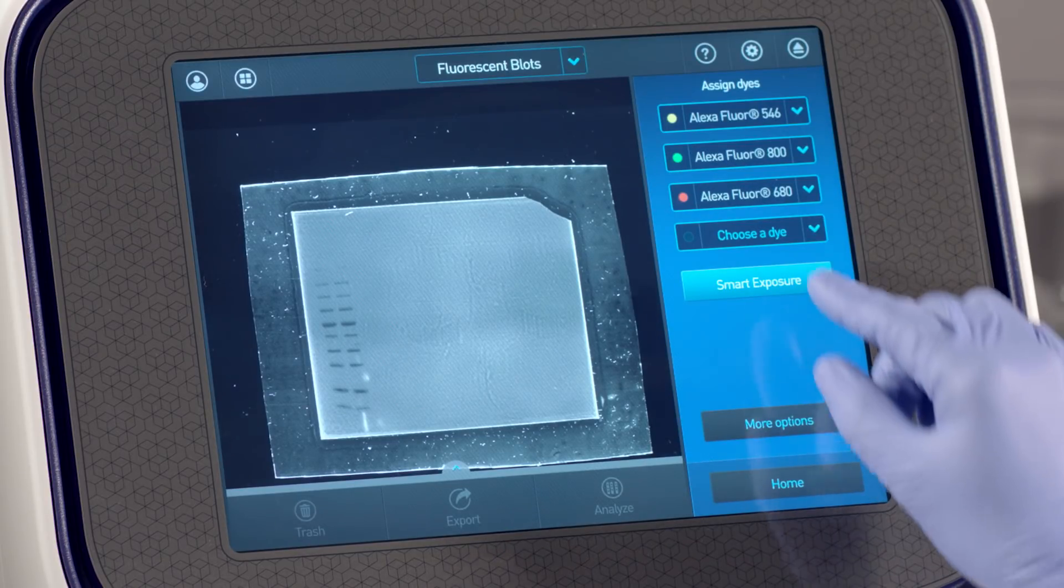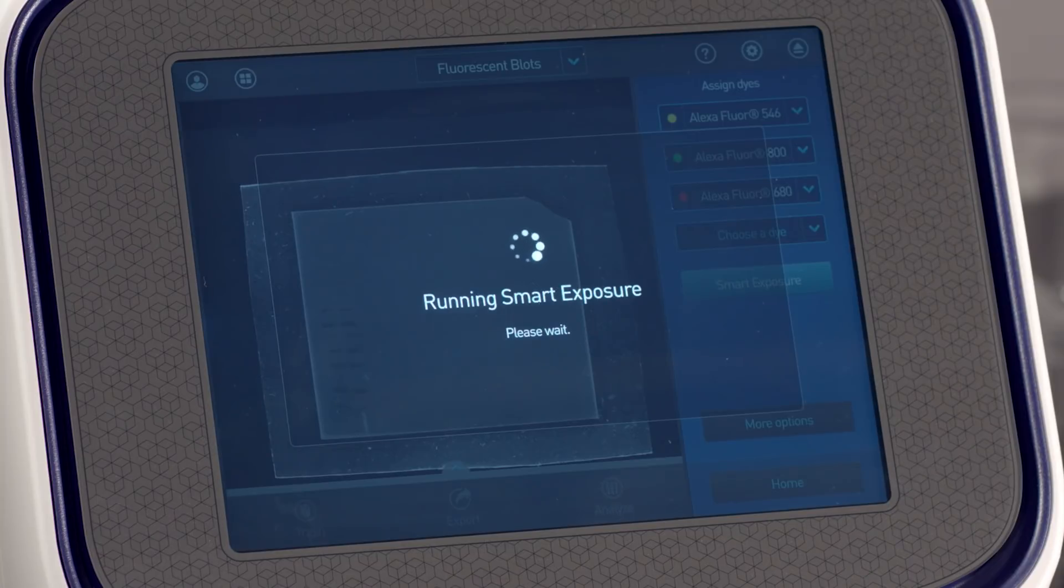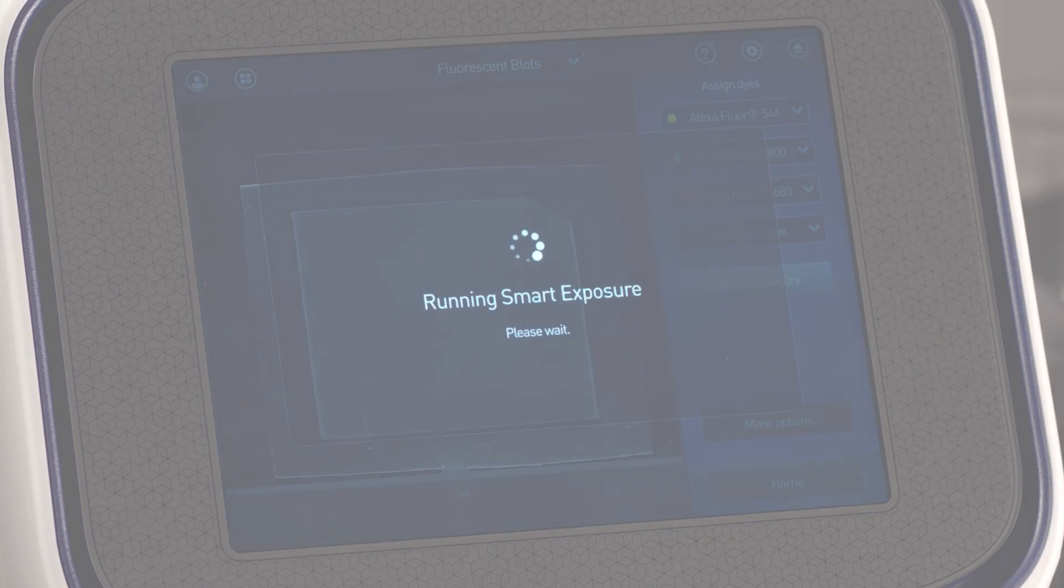Tap Smart Exposure to rapidly determine the optimal exposure time for each individual fluorescent channel. Smart Exposure greatly simplifies the complexity of acquiring multiplexed blot images.